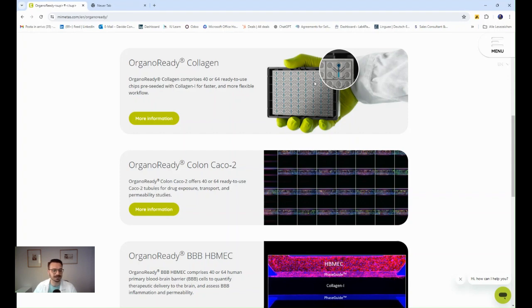And this is really good because instead of using pumps or any other systems, they place these plates on a, how's it called, a shaker basically, and then you can use it with relatively inexpensive devices. You don't need pumps, you don't need anything like this. It just rocks around, and then the liquid flows from one side to the other.